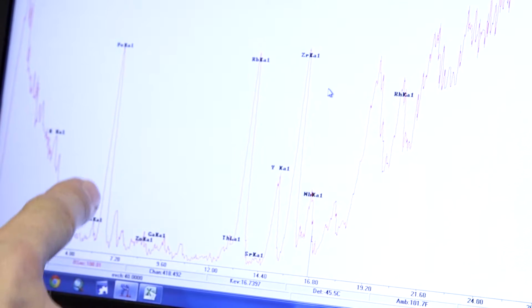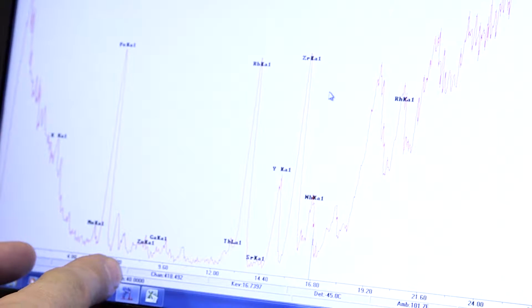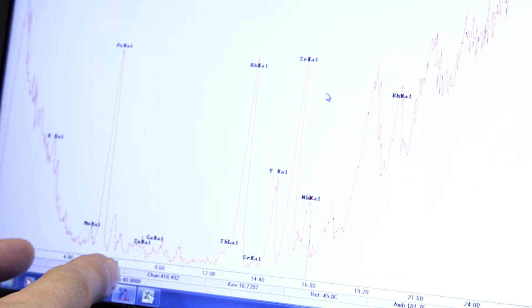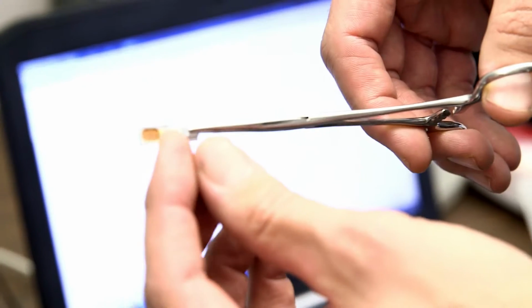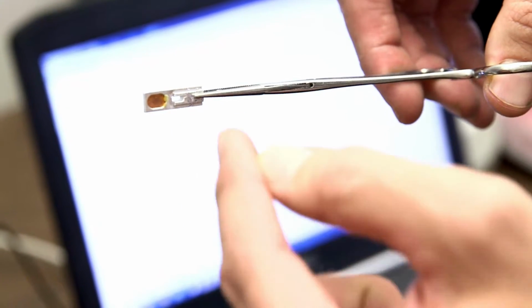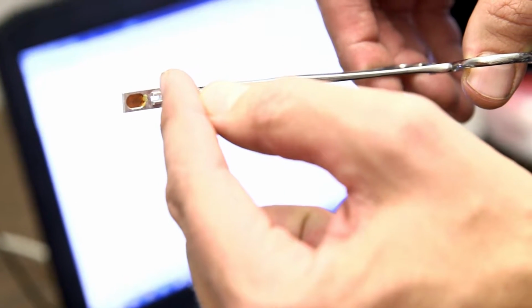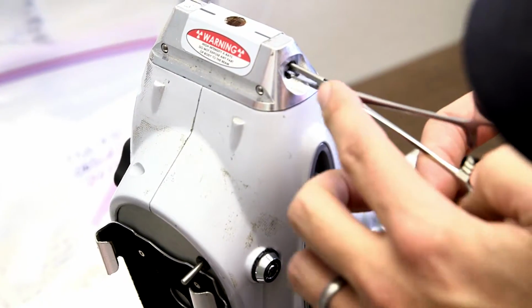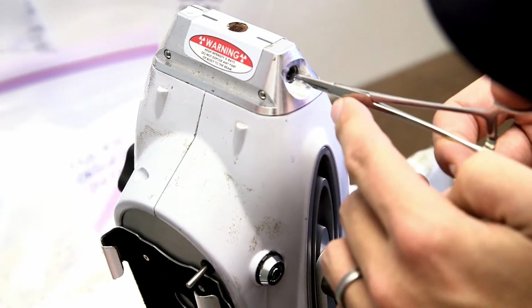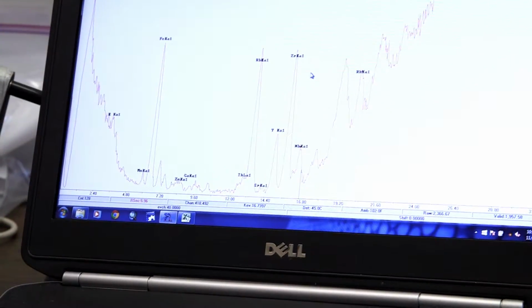For certain materials like volcanic rocks such as obsidian and rhyolite, we like to target a very defined range of trace elements. We place a filter that has specific concentrations of copper, titanium, and aluminum into the machine that can block ranges of energy released from the detector into the materials. This allows us to measure our target elements much more efficiently.